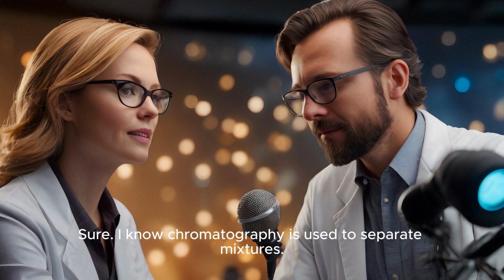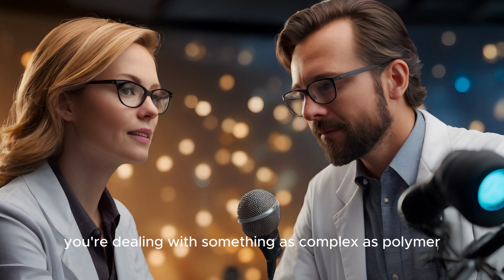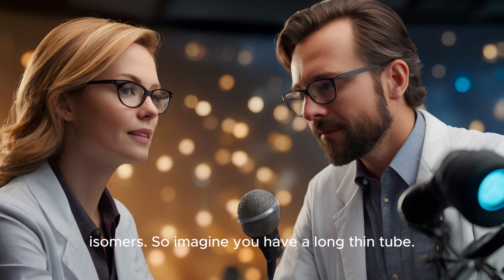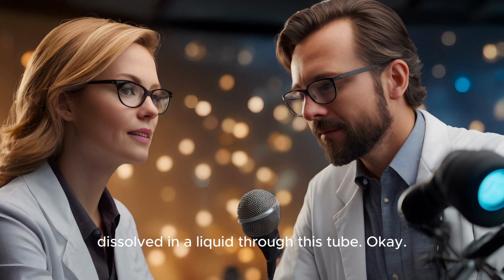Sure. I know chromatography is used to separate mixtures, but how does it actually work, especially when you're dealing with something as complex as polymer isomers? So imagine you have a long, thin tube packed with a material that has specific chemical properties. And that's your stationary phase. Then you pump your mixture of polystyrene molecules dissolved in a liquid through this tube. And that liquid is the mobile phase. So the polystyrene molecules are basically racing through this tube. In a way, yes.